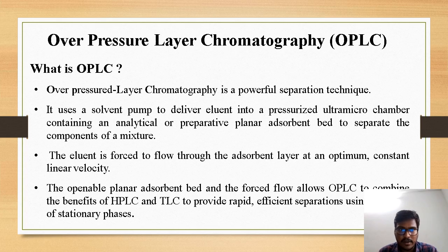Overpressure layer chromatography. What is OPLC? OPLC as a forced flow planar layer liquid chromatography technique is based on the ultra micro chamber. It was developed and introduced in the late 70s by Hungarian scientists. Overpressure layer chromatography is a powerful separation technique. It uses a solvent pump to deliver elutant into a pressurized ultra micro chamber containing an analytical or preparatory planar adsorbent bed to separate the components of a mixture.